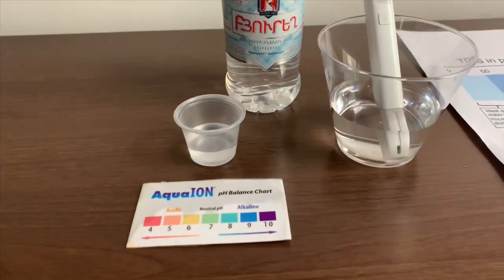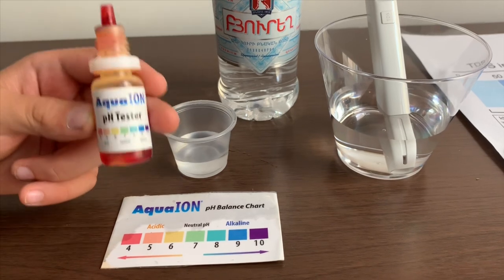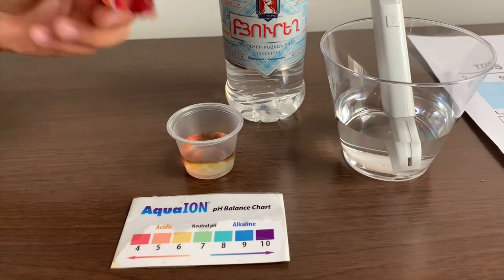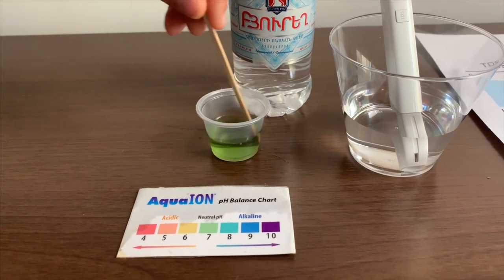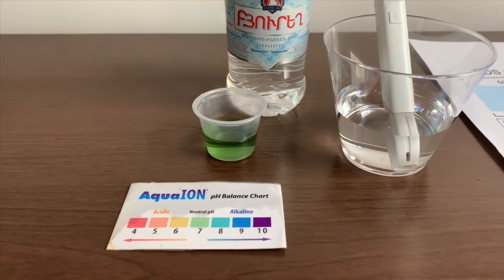Now, let's test the pH level. If you want to buy this pH tester, check the link down below. Only do two drops. Let's stir it a little for a better result. I'll give this a 7.5. This is neutral pH.